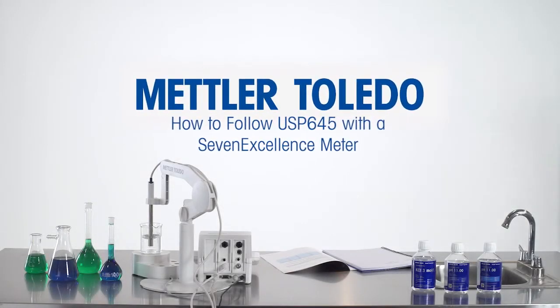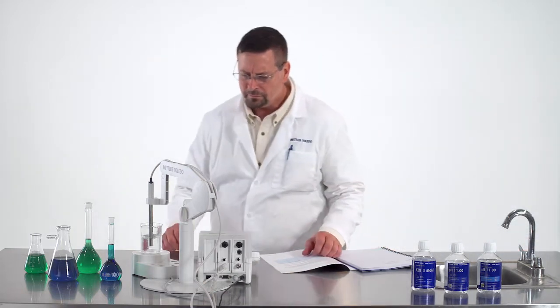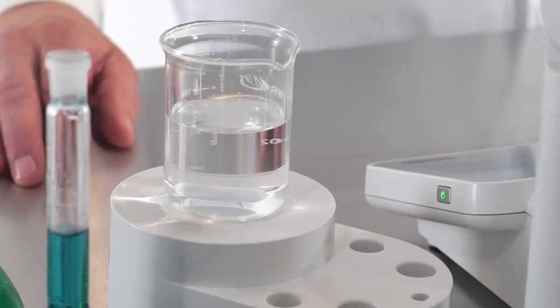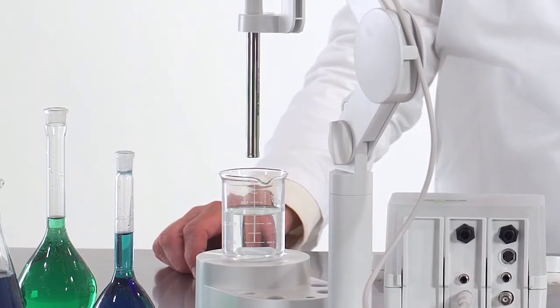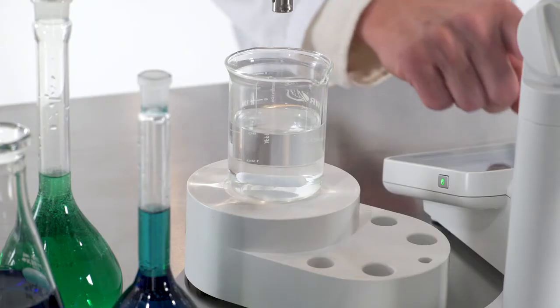United States Pharmacopoeia Method 645 dictates requirements that control the quality of the water used for a variety of pharmaceutical products. Execution of this method is typically lengthy, tedious, and error-prone. It can even require the use of a pH meter.